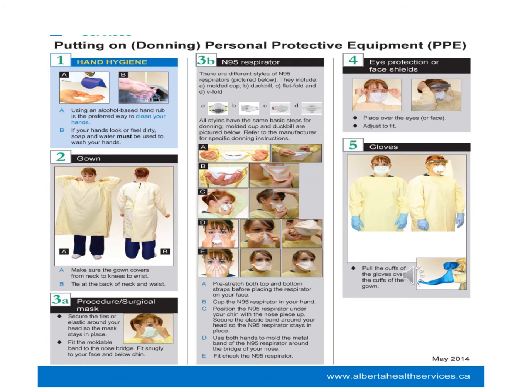And of course, use your hand to make a cup: put the respirator in one hand, and with the other hand place the strap over your head, so that the respirator sits accurately over your nose and mouth, and then tie up. So you can go through these procedures and follow these steps to wear the respirators.